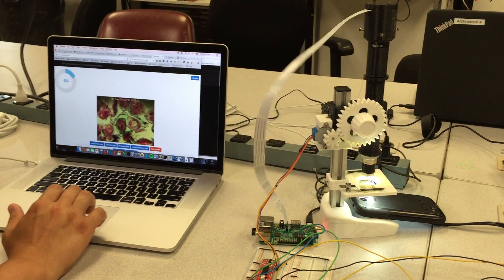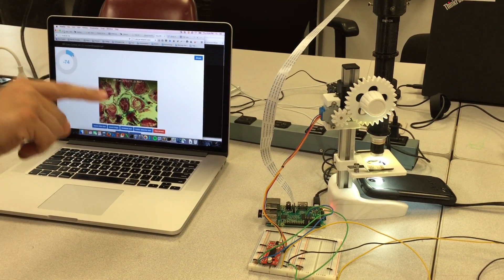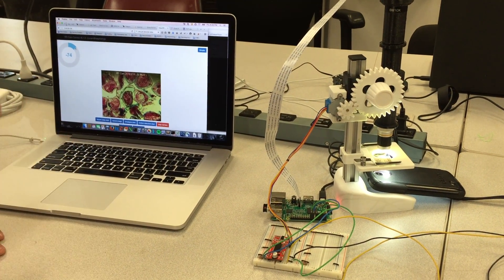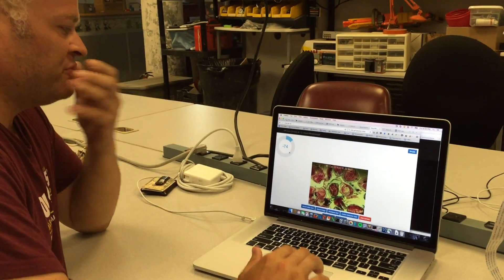So you want me to actually explain what I'm doing now? Yes. So what I'm doing here is I am adjusting the focus on the microscope. I've got fairly granular control by doing this.